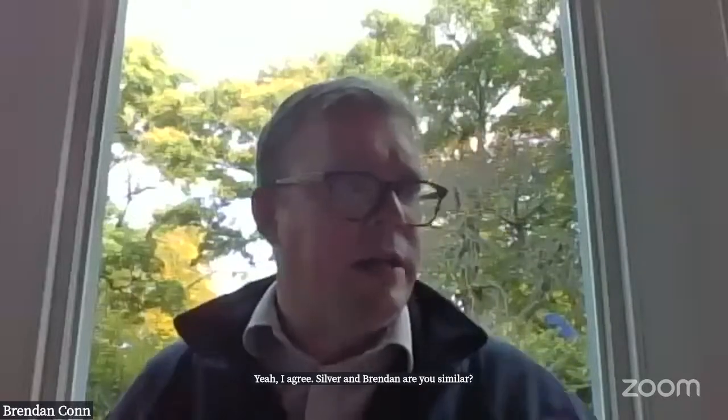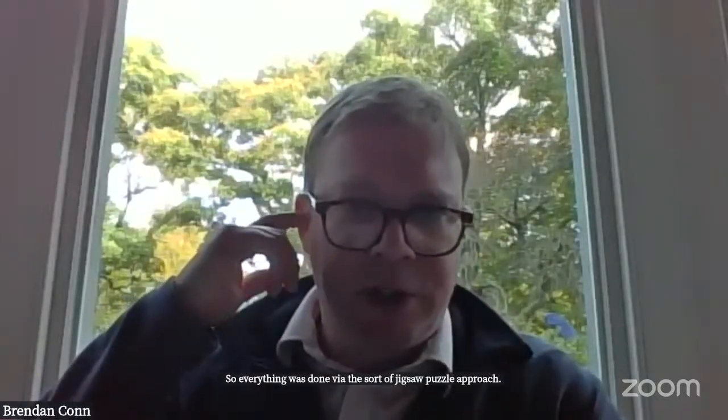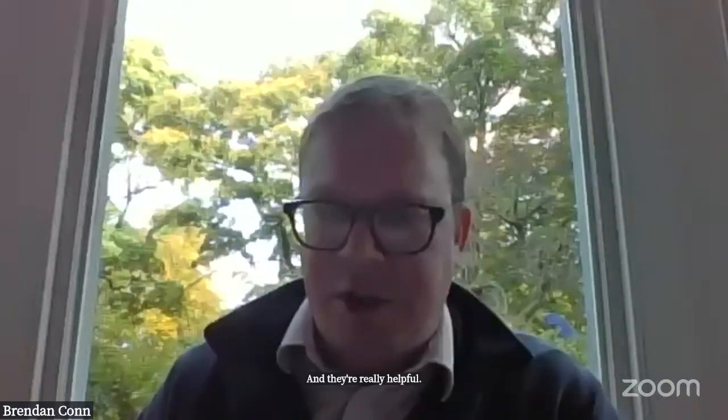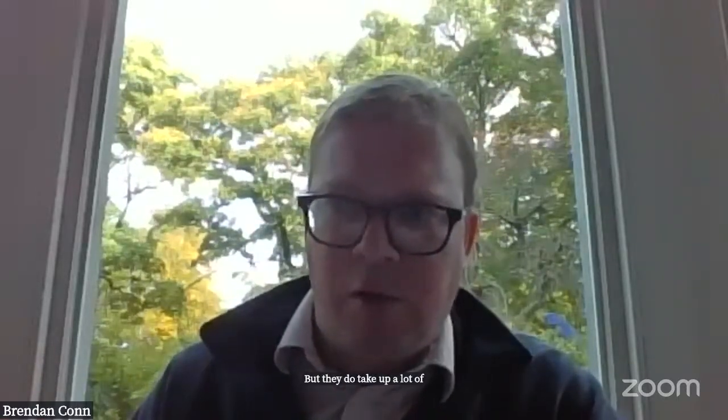I trained in places which didn't have mega blocks, so everything was done via the jigsaw puzzle approach. And I've trained in places which did have mega blocks, and I work in a place which does have mega blocks, and they're really helpful for the reasons I stated in my presentation. But they do take up a lot of resources.